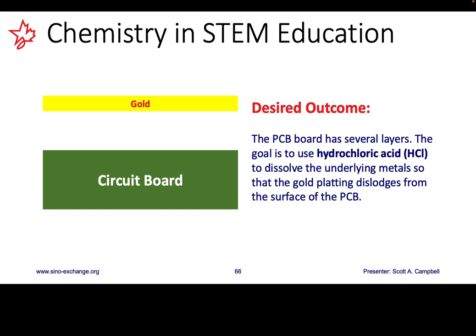Due to the time it takes for this process to occur, you will likely want to split your lessons. Have students spend a few minutes addressing the practical requirements of the lab, and then the remainder of the class addressing theory. This could include updating their lab books with observations, procedural notes, and also covering the theoretical aspects of the lab. After 72 hours, the solution will be ready for the next step.